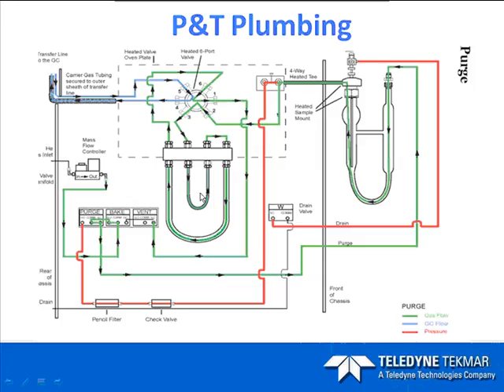The idea behind the condensate trap is that the analytes are purged at a lower temperature, usually around 20 degrees, and the water will drop out into the bottom of the condensate trap, and the analytes will pass over the top of that and continue on through the adsorbent trap where they're caught.